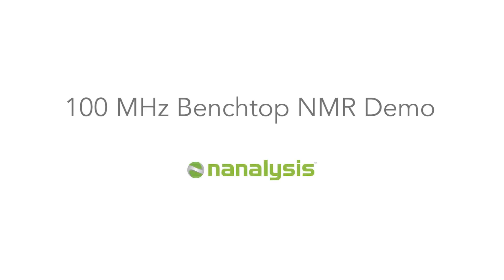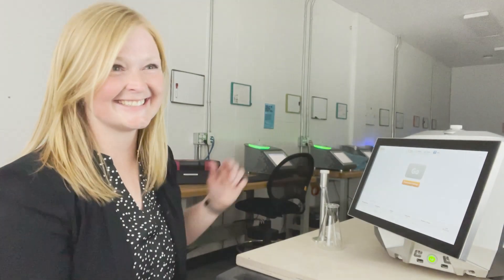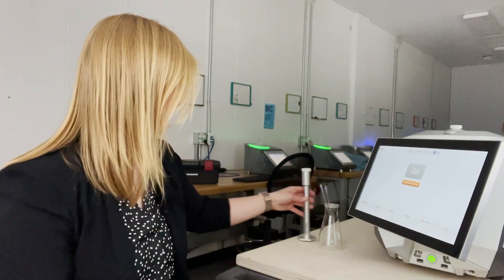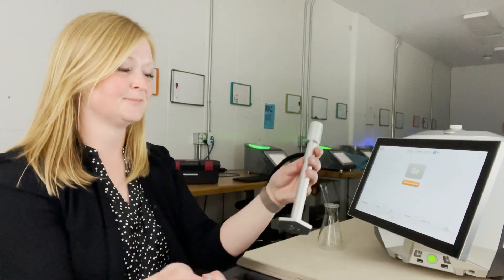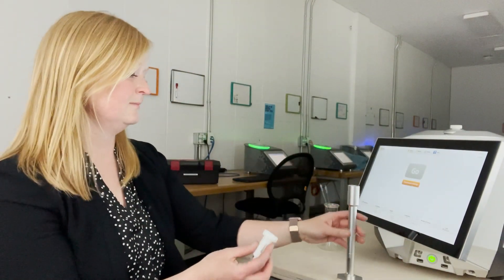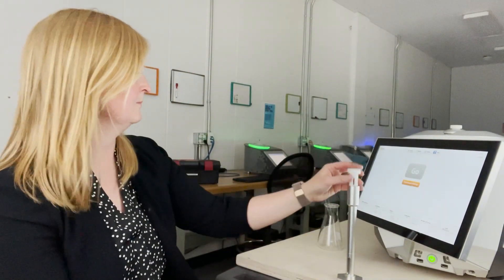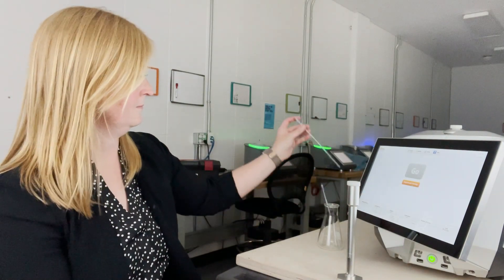Each 100 MHz benchtop NMR spectrometer comes with a sample holder and depth gauge. To use, the NMR tube is placed into the sample holder and pushed to the bottom of the depth gauge.